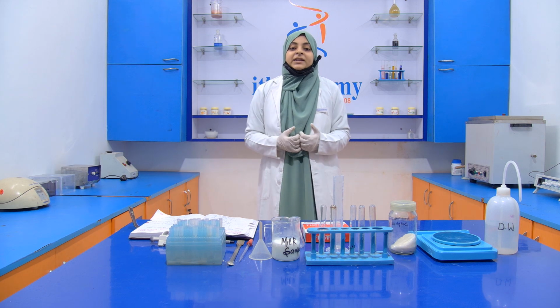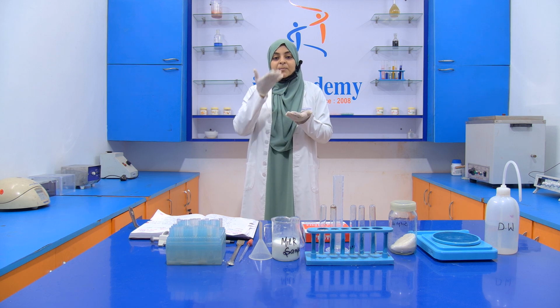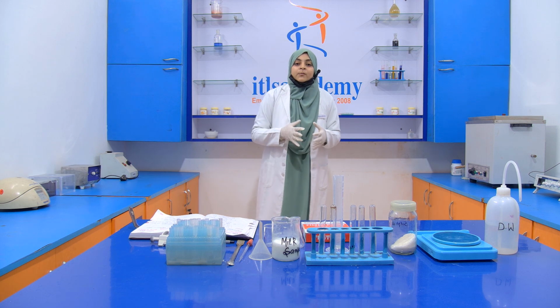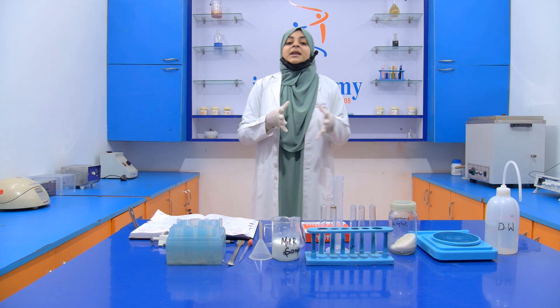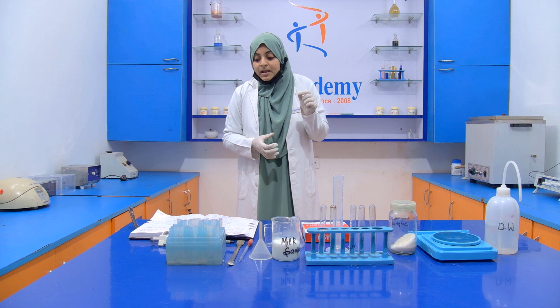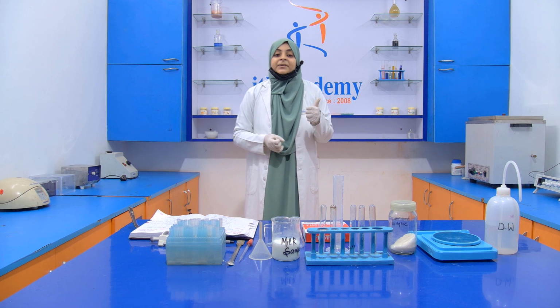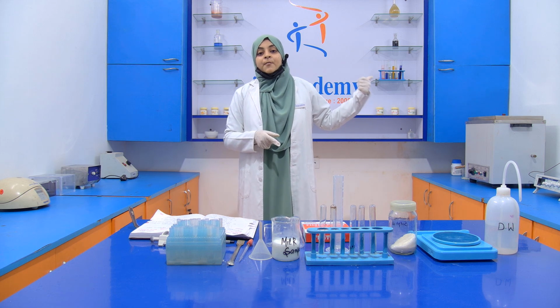When we have filtered that mixture, we get two things. One is a cake, which we get just above the filter paper, and the other is the filtrate, which we get inside the beaker. Now from the filtrate we take 5 ml, and then we keep that test tube inside the water bath at 100 degrees Celsius for 5 minutes.